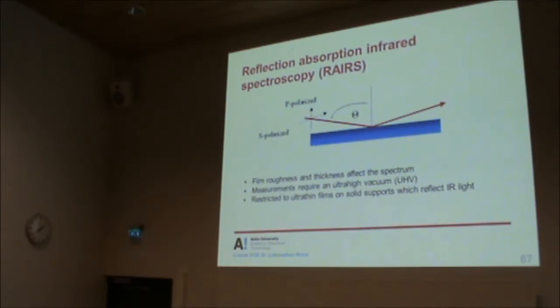The good thing about the light that we sent in the previous cases, the normal light, not the polarized light, is that the vibrations are happening in all planes. It's a mixture of all planes. So you don't have to worry too much about the angle of this plane and the angle of this plane. There will always be some light waves that have intensity in the right plane.